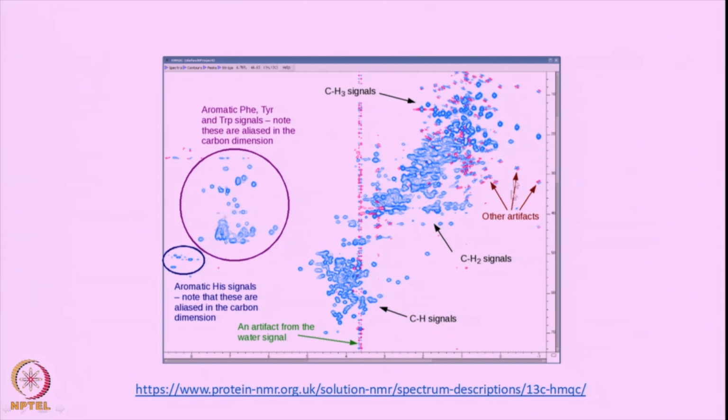The reason why you choose only a small chemical shift range here is because you improve the resolution. Your spectral width is reduced, so acquisition time can be increased along the F1 dimension, so that you have a better resolution along the F1 dimension. And this is particularly important in the case of carbons, because the carbon chemical shift range is quite large, and generally it is not possible to excite a wide chemical shift range with simple hard pulses. So special tricks will have to be used, you need high power and all of those complications. Therefore, you allow them to fold, so you can still analyze even the folded peaks here as well.